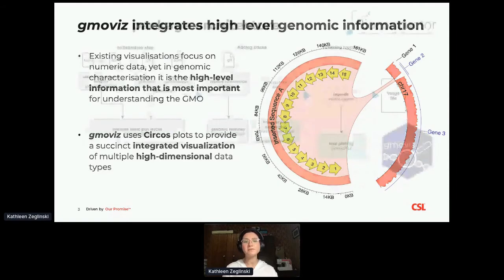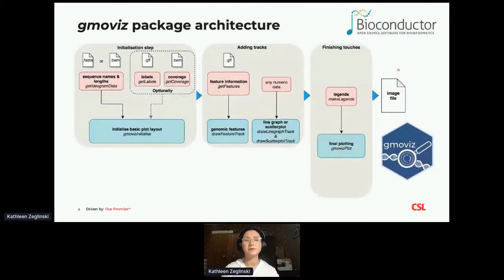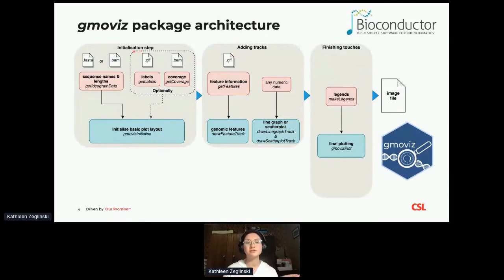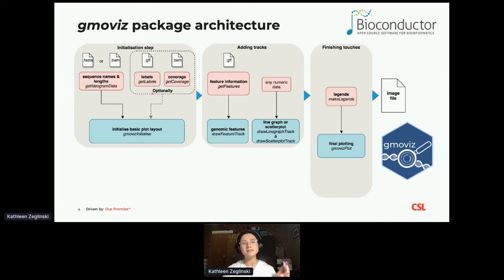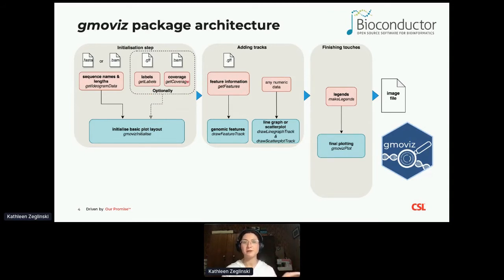In terms of how we generate a plot like this using GmoViz, there are three key steps. The first is to initialize the plot, which starts with reading in the sequence names and lengths and setting up the layout — each sequence we want to visualize gets its own sector around the circle. Optionally in this step, we can add labels and coverage information, as was done for the diagram I showed previously.